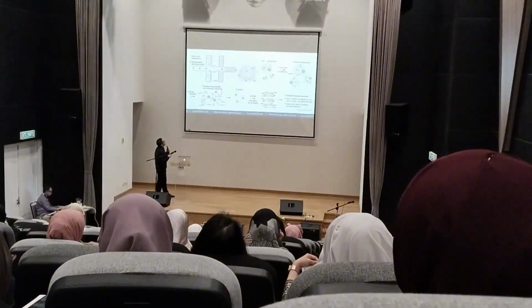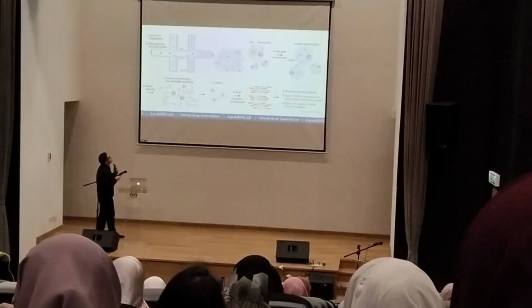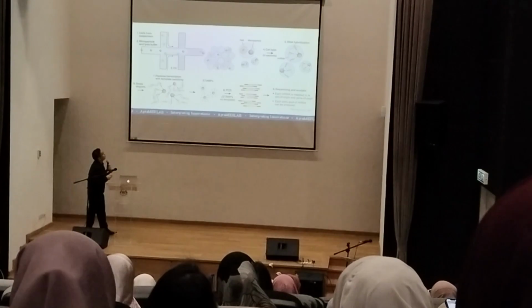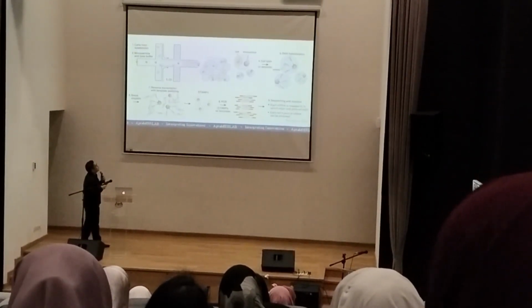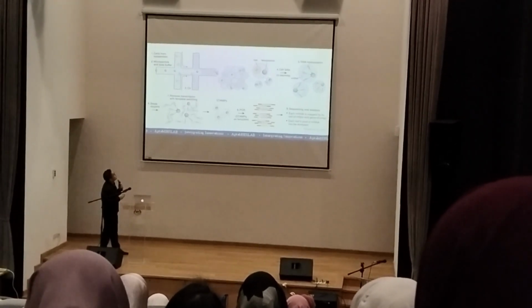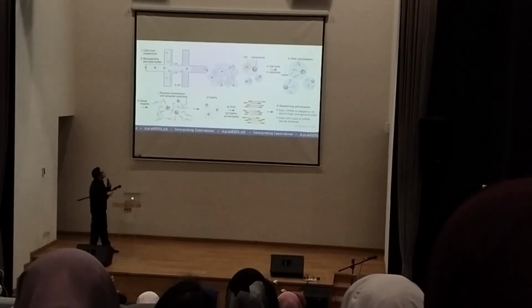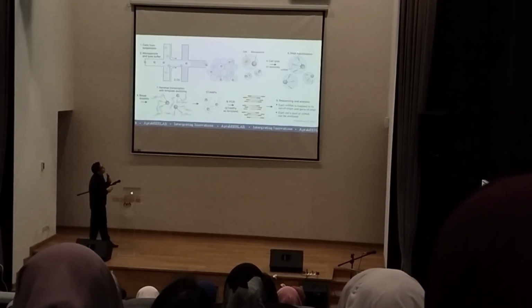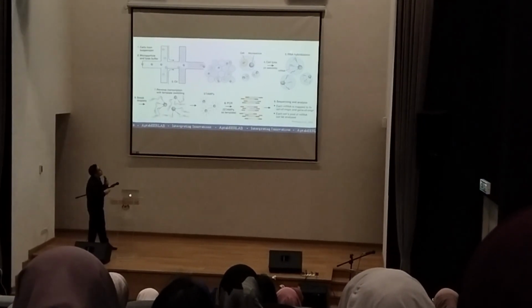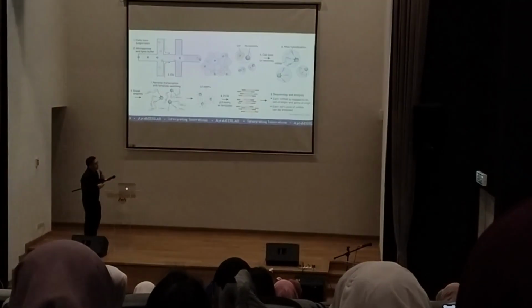So you will see single cells and single beads in one capsule. From here, the next step is the lysis buffer inside the microparticles will lyse the cells and then expose the RNA into the microcapsules, and this RNA will hybridize with the adapters inside the capsules.